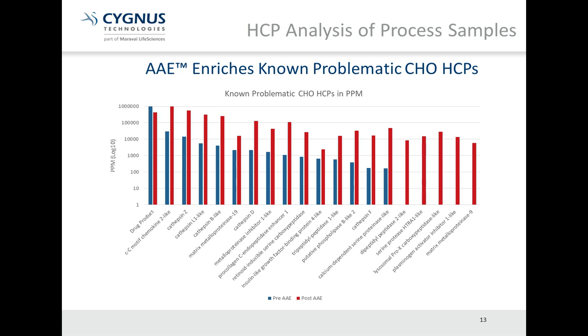And also one more point, as you can see, the 5 red bars on the end were not detected prior to mass spec, or prior to AAE. So again, AAE just gives us an additional insight that we did not have before.